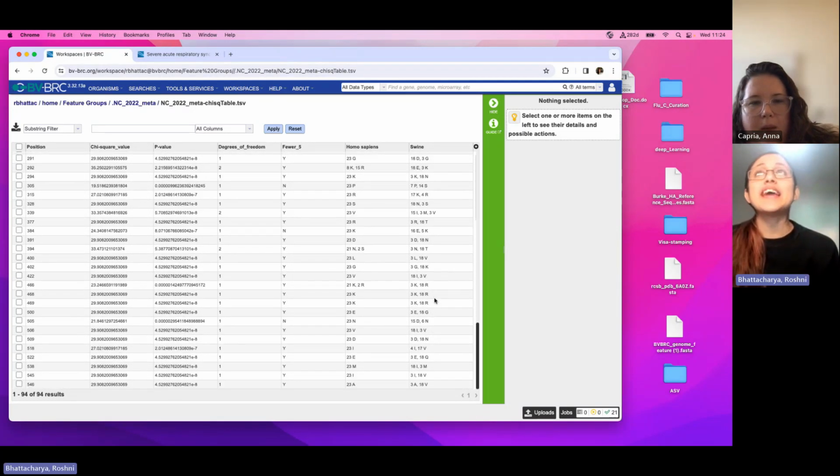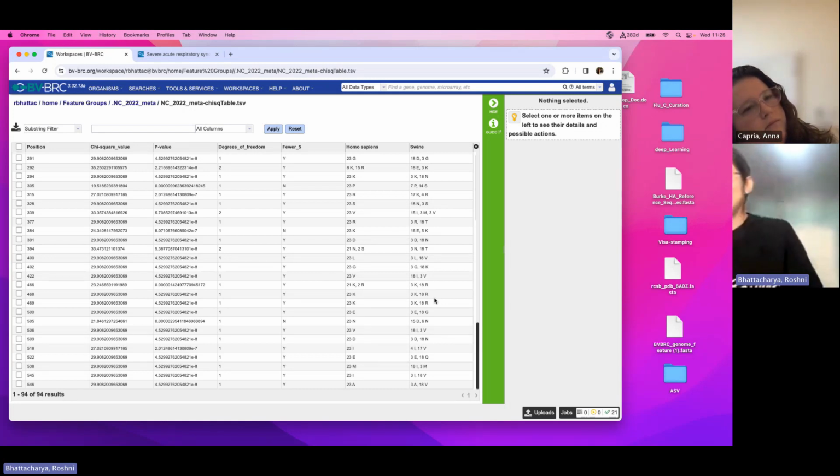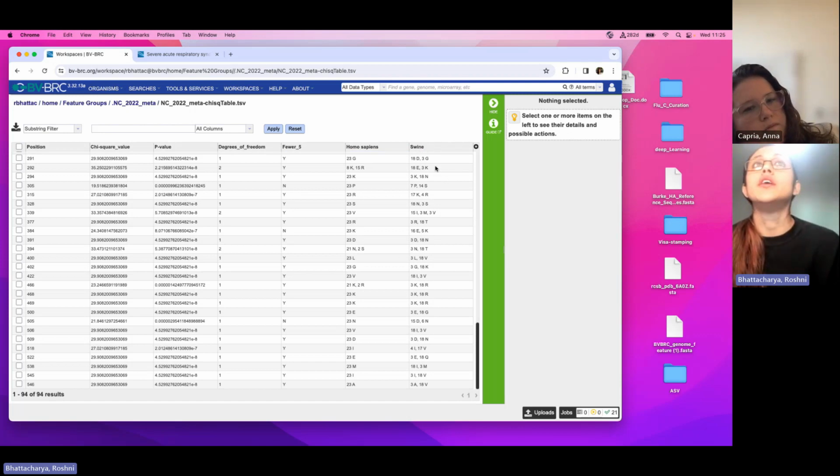And the next step you can take is you can do a multiple sequence alignment of everything. I'm not doing it currently here, but just for the sake of another evidence and just to match or verify what the Meta-CATS is coming up with, this change in residue, that it's actually true. If you can do that, then there is another evidence.